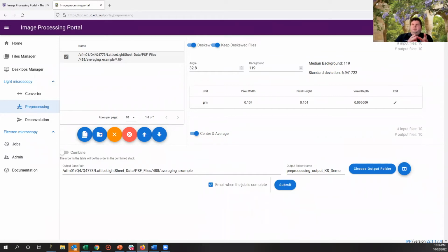With the home-built system, you have limitations in LabVIEW with how much you can see at the time of capture. On the 3i system, you can certainly see a little bit more, and you can dynamically go back and look at what's happening with changes in the data set. What we did to overcome one of the issues that's relevant to this is, instead of waiting to the end of the file to be processed and then ending up with a giant TIFF, or a SlideBook file in the case of 3i, we could chop it up on the fly, and then we could look at all those volumes individually.